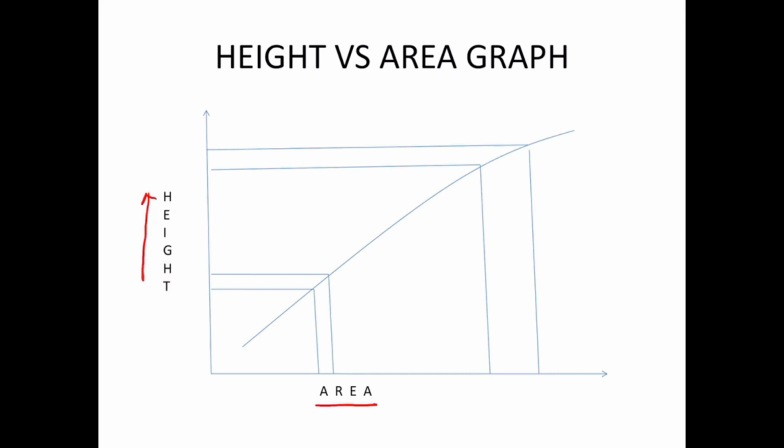Now can you recall from your 11th standard physics how the graph will look when the component on the x-axis is proportional to the square of the y-axis? We know that it's going to form a parabolic curve like this, and all the cells which are flowing in a fluid phase in a single file are going to fall on this parabolic curve.